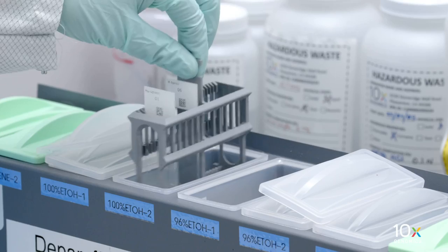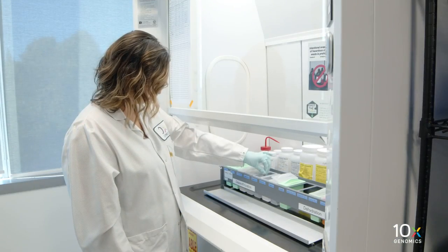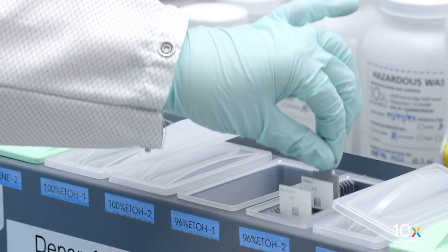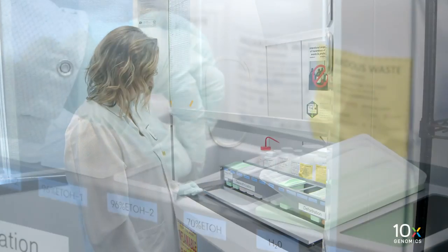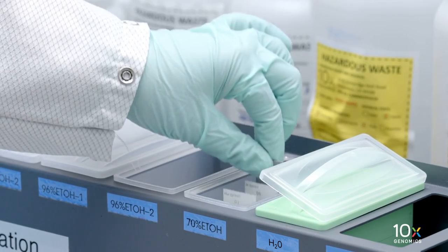Next, gently immerse the slides in 96% Ethanol Staining Dish 1 for 3 minutes. Gently immerse the slides in 96% Ethanol Staining Dish 2 for 3 minutes. Next, gently immerse the slides in the 70% Ethanol Staining Dish for 3 minutes.